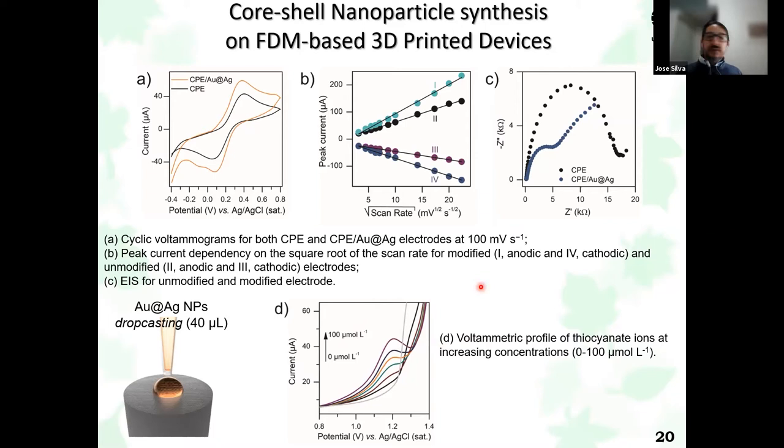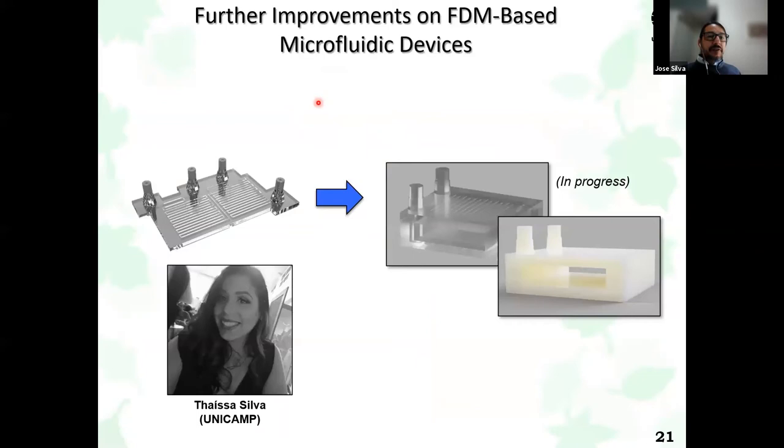A further movement for the production of this is to transform this one-plane reactor into a different-planes reactor. We call this different floors. So we can have really different conditions of synthesis or reaction in this floor compared to this one. For example, one idea is to put a Peltier device inside this device here, so we can have one situation with a temperature completely different from the other. That can be very useful when you need different conditions for the synthesis.